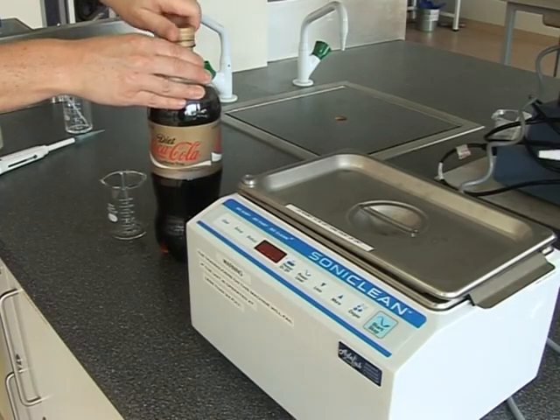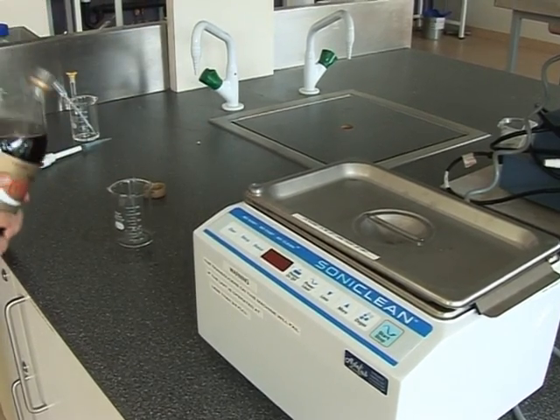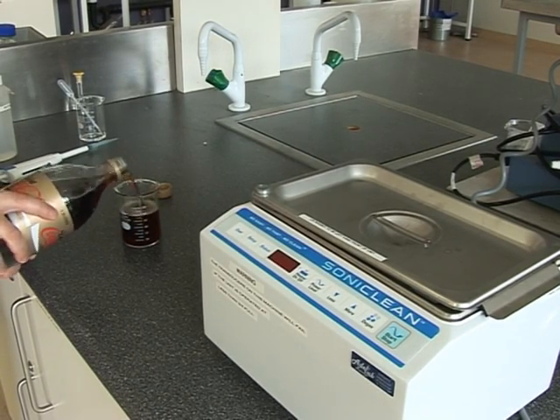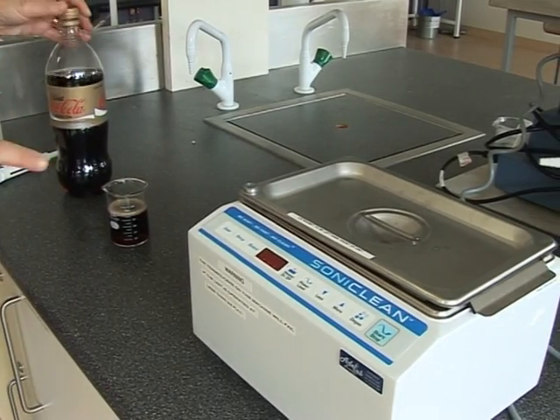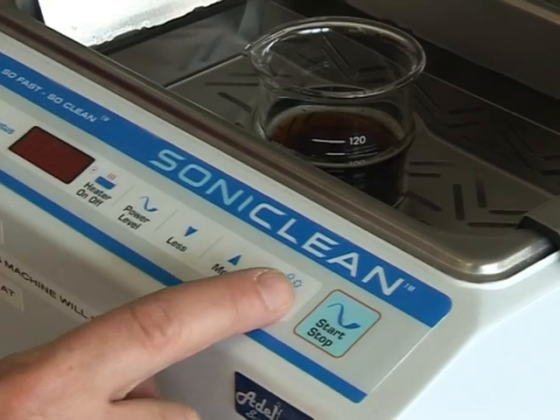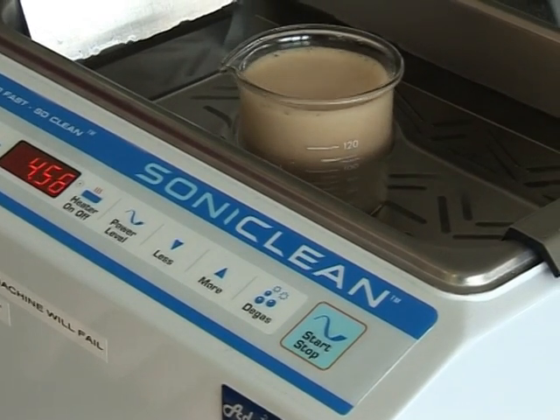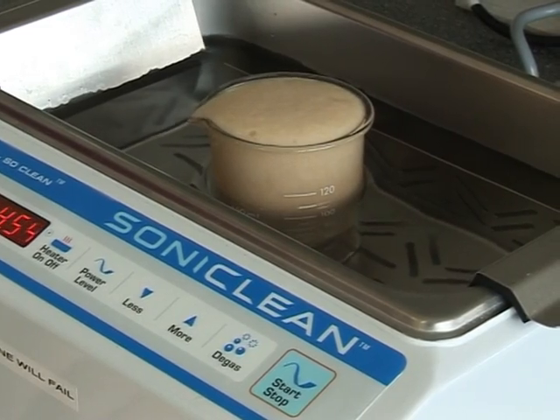Next, you need to prepare your soft drink samples. Pour some soft drink into a beaker until approximately half full. Place the sample into a sonic bath and run the bath for 1 minute to degas the sample. If after 1 minute the sample still contains visible bubbles, run the bath again for 1 minute and proceed to do this until all the bubbles have been removed.